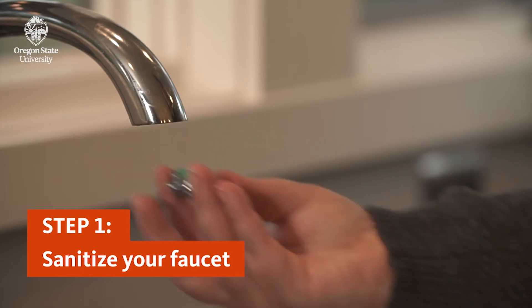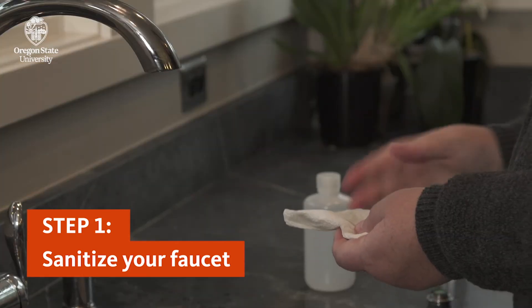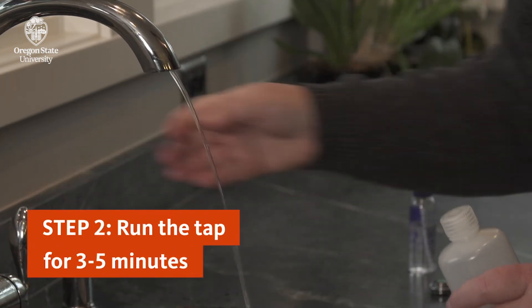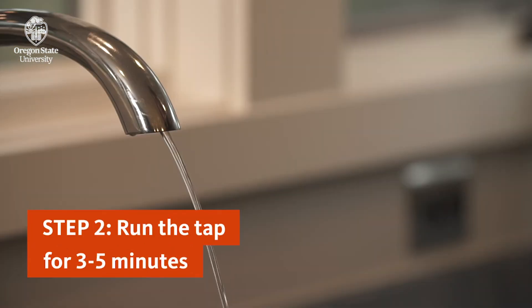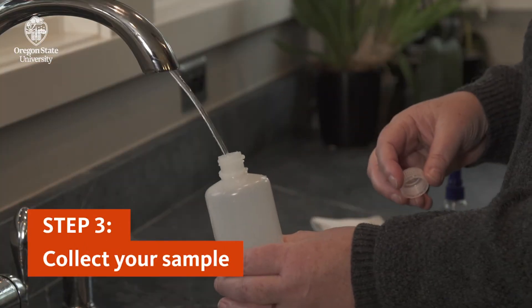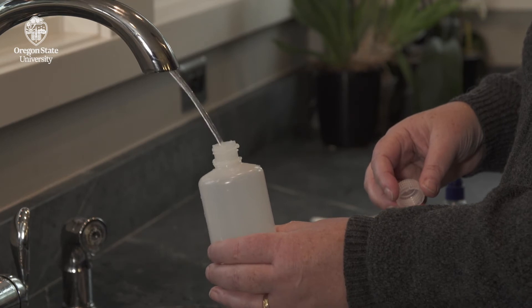First, remove any faucet attachments and clean the tap with isopropyl alcohol or a sanitizing wipe. Let the water run for three to five minutes before taking your water sample. Carefully open the sample bottle. Don't touch the rim or inside of the bottle, and do not rinse it out, even if it looks like there's powder inside.